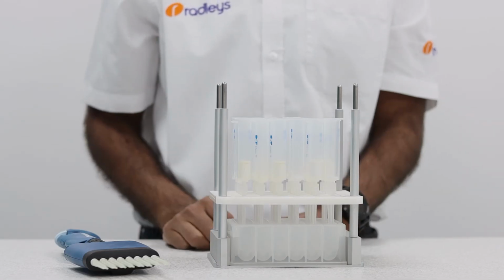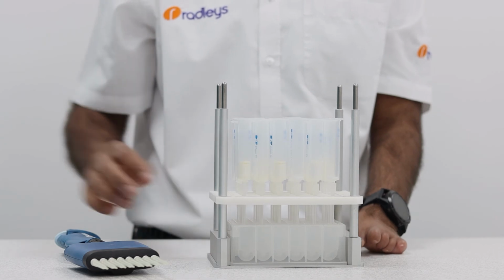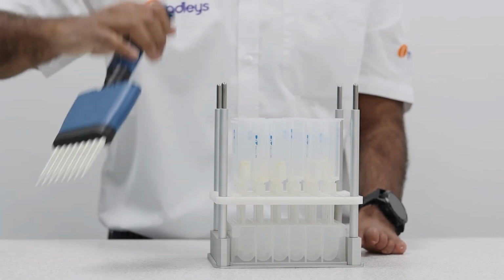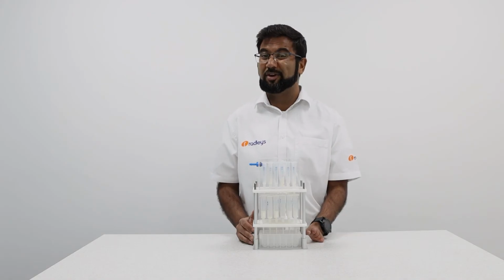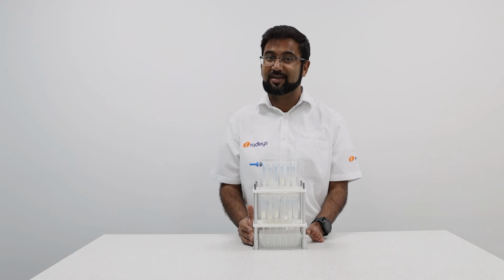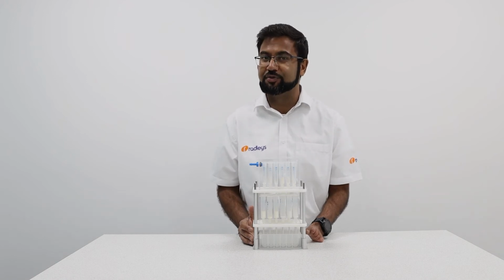Once the 2-stage setup is complete, using a multi-channel pipette, load on your samples. Positive pressure is not normally required for phase separation. However, for filtration and SPE, a gentle positive pressure can be used.